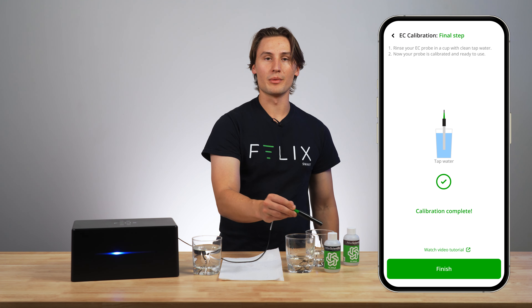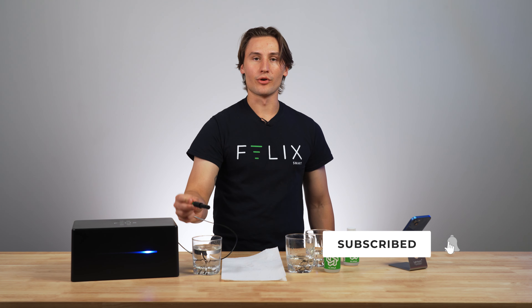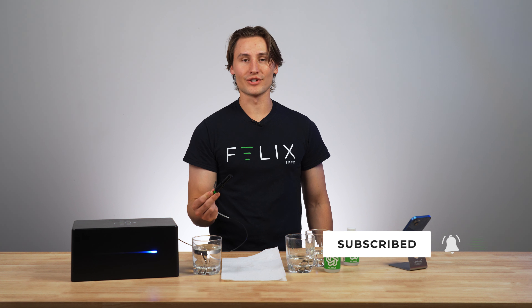Now I can rinse my EC probe in my clean tap water. My probe is all good to go — I can stick it in my water source and start getting measurements.